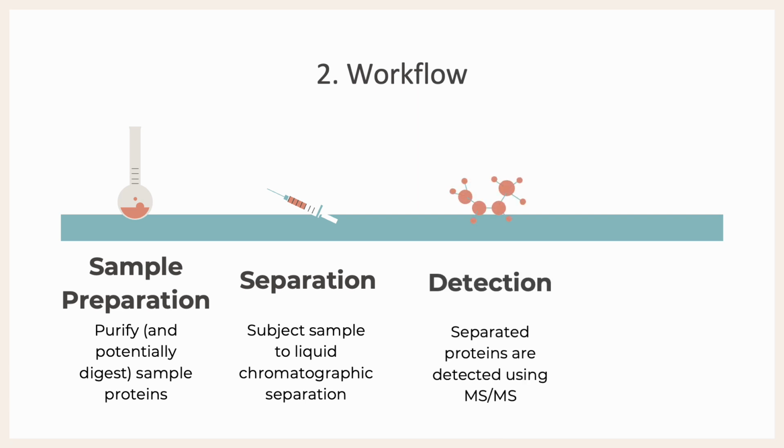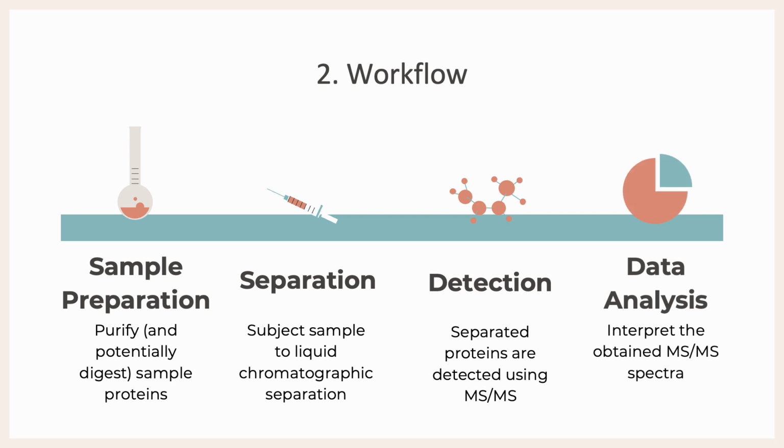Third, we're using tandem mass spec, or MSMS, which is the notation used in writing, to see how much protein is there. Is my protein there? Essentially, this is our detection phase. And finally, data analysis. How do we essentially recognize our protein within the data and how we analyze it, essentially?